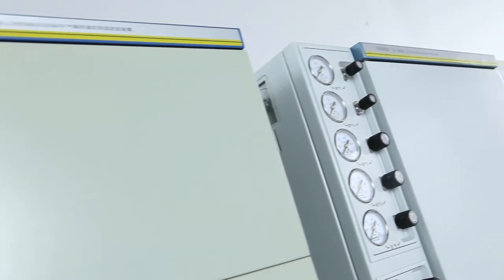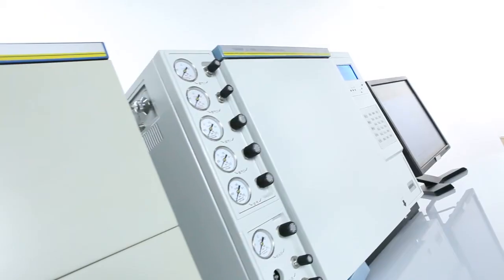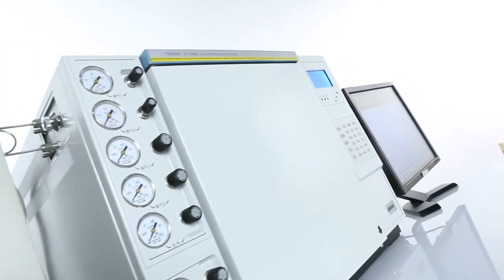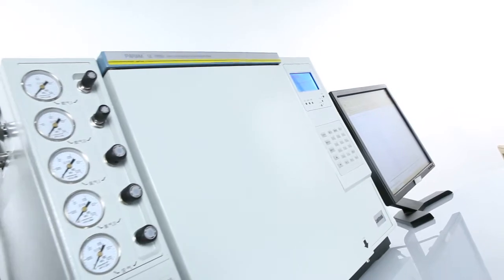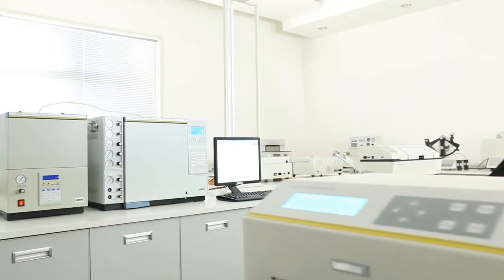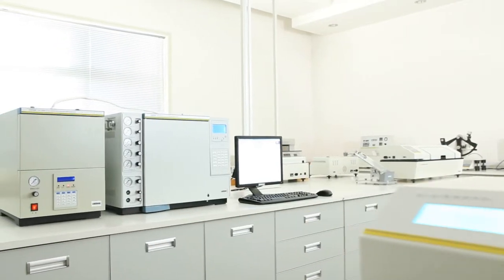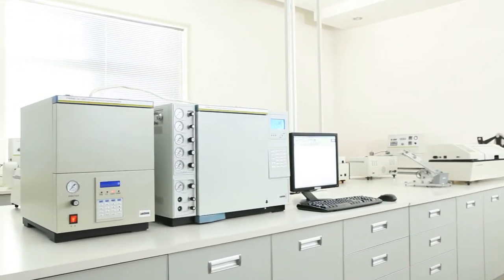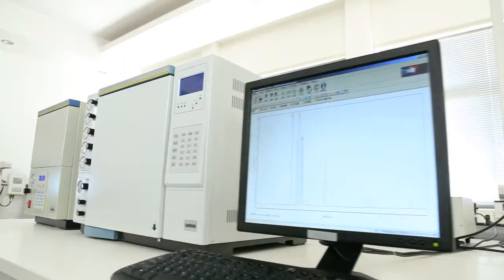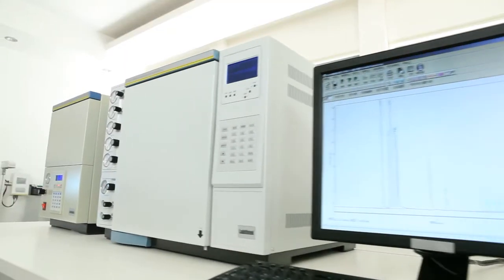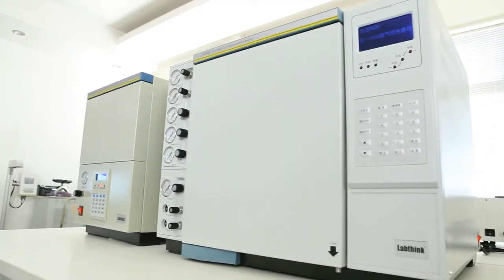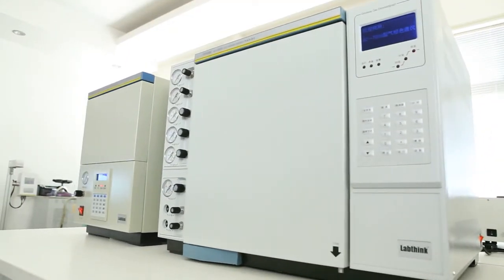The GC7800 Automatic Organic Solvent Residue Analyzing System is LabThink's latest gas chromatography system, which is designed for measuring the quantity of organic solvents left on printed packaging products.